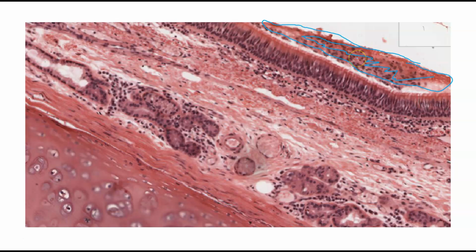Thus, our epithelium, which would be the cells directly interacting with that external environment, would be right here. So here's the very bottom of our fake layer. Remember, pseudo means fake. So our pseudostratified columnar epithelium. And you can see the nuclei of them right there. Nuclei, nuclei, nuclei.